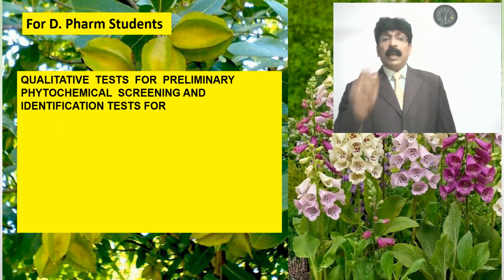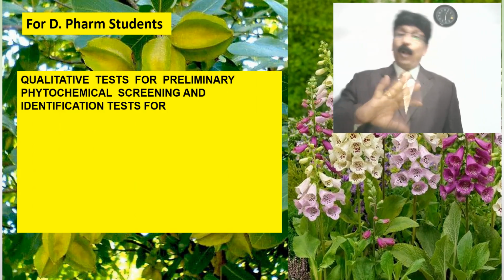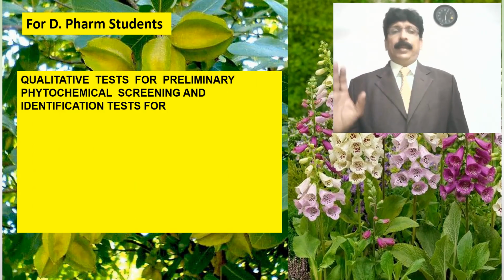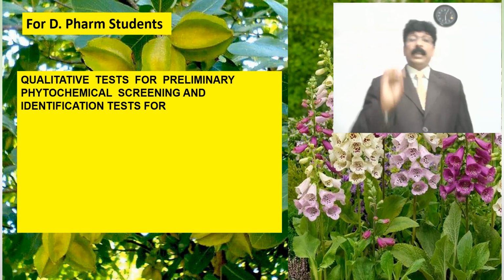In this class we are going to discuss qualitative identification tests for preliminary phytochemical screening.